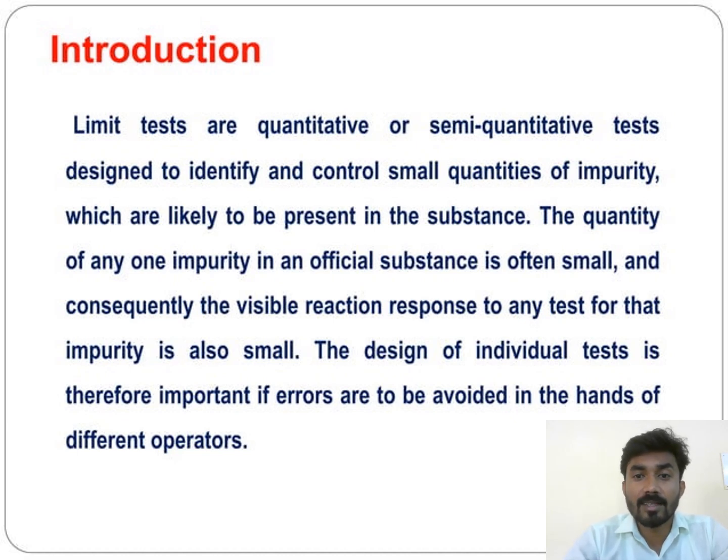Limit tests are quantitative or semi-quantitative tests designed to identify and control small quantities of impurities which are likely to be present in the substances. It means a limit test is a type of quantitative or semi-quantitative test that has a set of procedures to identify and control small quantities of impurities present in the official substances or drug substances.